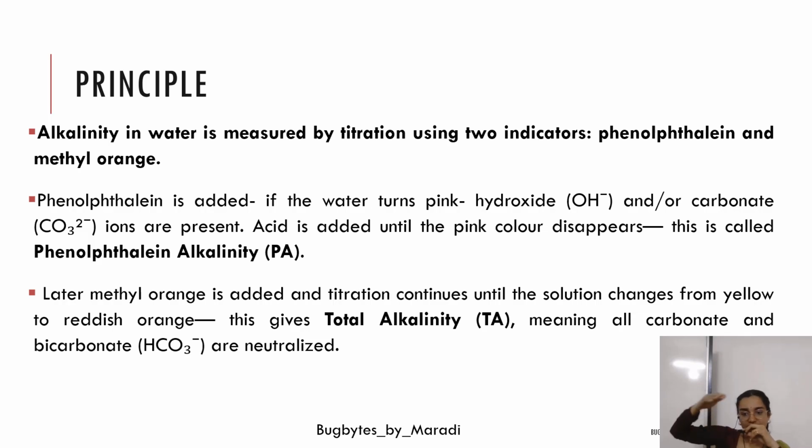Some people even consider the end point when it reaches pink in color, but we usually stop at reddish orange. It indicates that the sample has been completely neutralized, and this process helps to identify the forms of alkalinity, which is very important for pH control in water treatment and other things. So that's the principle of this particular experiment.